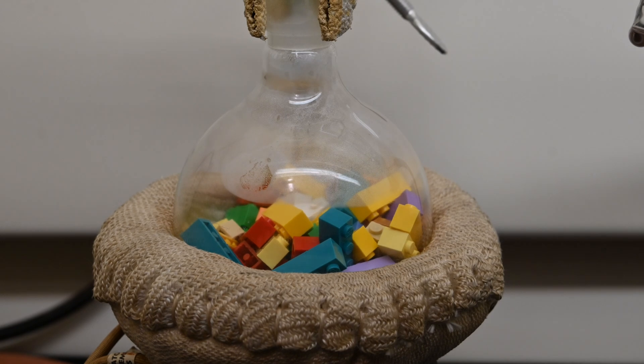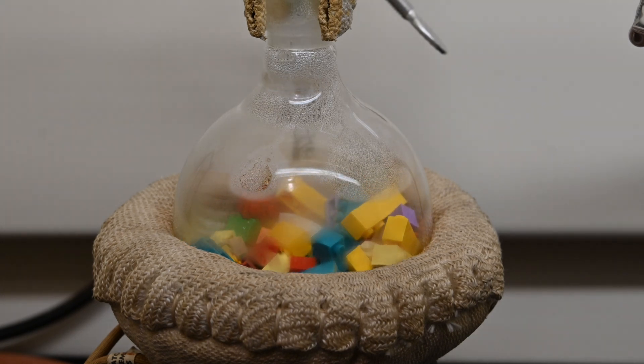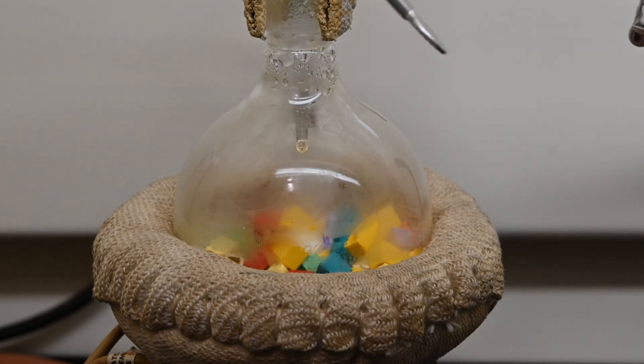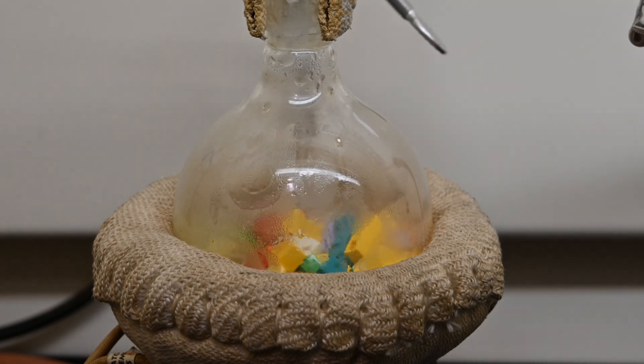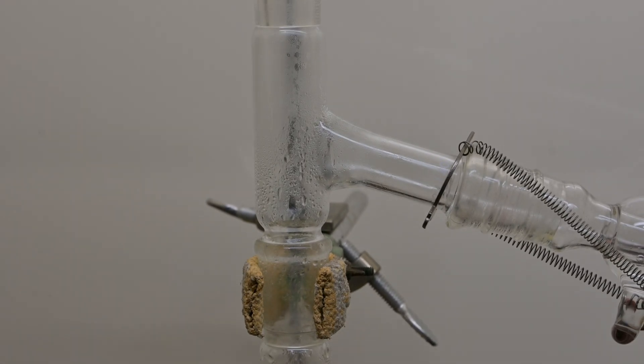When the temperature reached around 250 degrees celsius, the ABS plastic began to melt, and at around 500 degrees celsius, the plastic began to break down. As breakdown occurred, liquids started to boil off and climb up the flask, eventually reaching the condenser and running down into the collection flask.